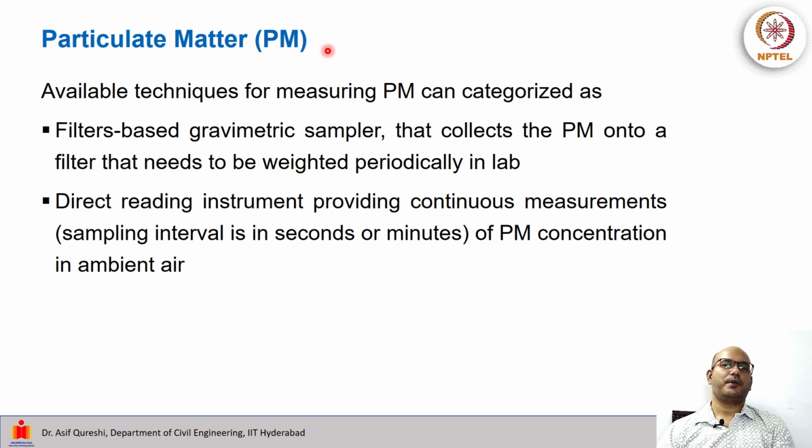Then we will go into particulate matter, and we have many techniques for measuring particulate matter. They can be characterized generally as filter-based gravimetric samplers that will collect PM into a filter, and the filter needs to be weighed before the start of sampling and then at any period of time when we need to make a measurement.